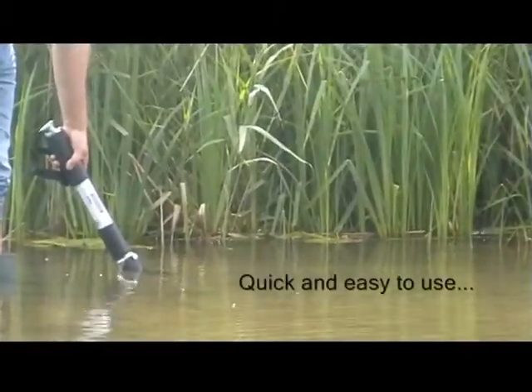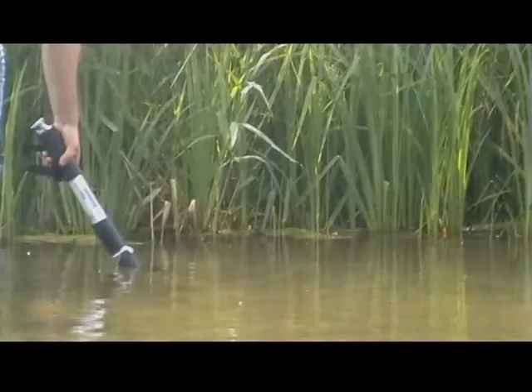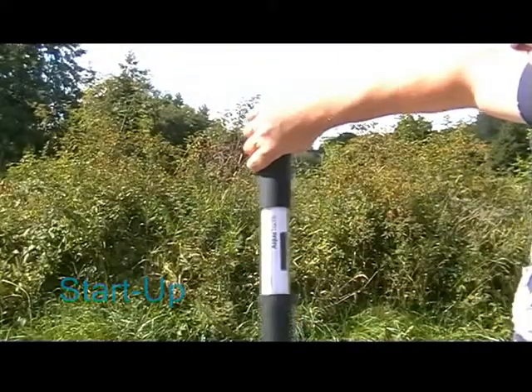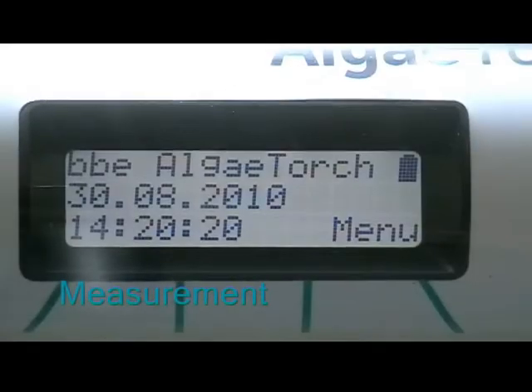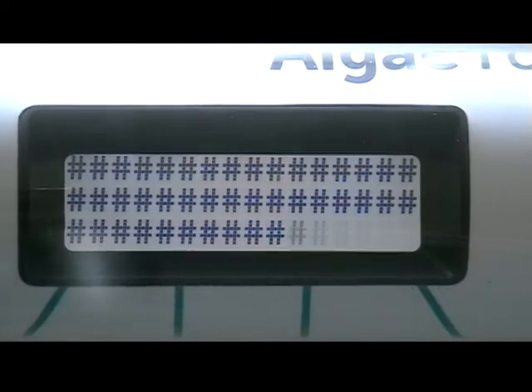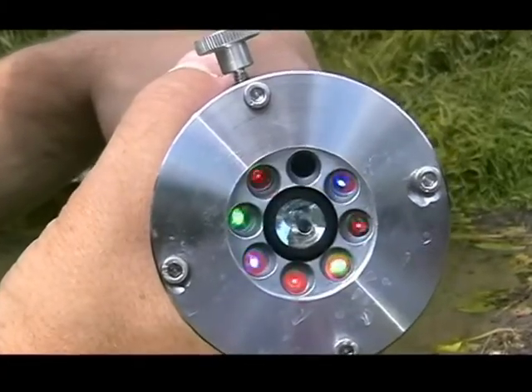The Algae Torch is simple and easy to use, submerged in the water at the site to be measured. The instrument is started by rapidly tilting it upwards and downwards as shown. To start the measurement, simply press the keys menu and then OK on the side of the instrument. The display shows the countdown to the initiation of the LEDs and then the seconds remaining until the end of the measurement.